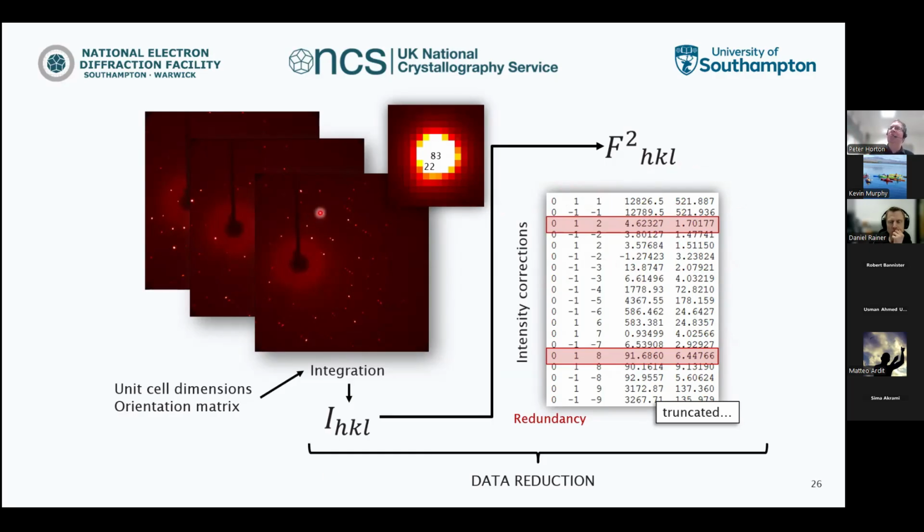And this is basically what we do. We reduce all these images that generally will come to a few gig of data down to a single file that's generally somewhere between 1 and 10 meg. Now, there is extra information we're removing, but normally 90%, 95% of the time, this is all the information we need.